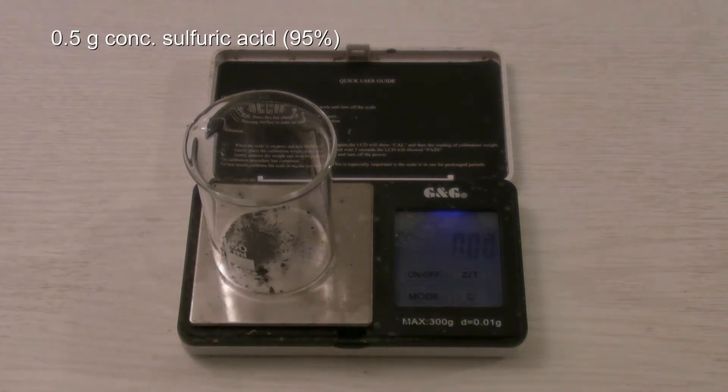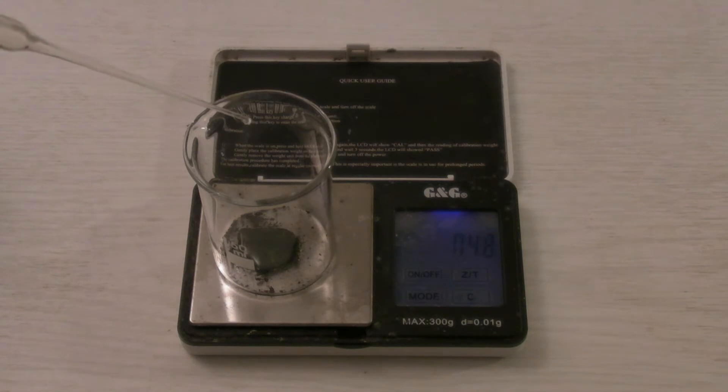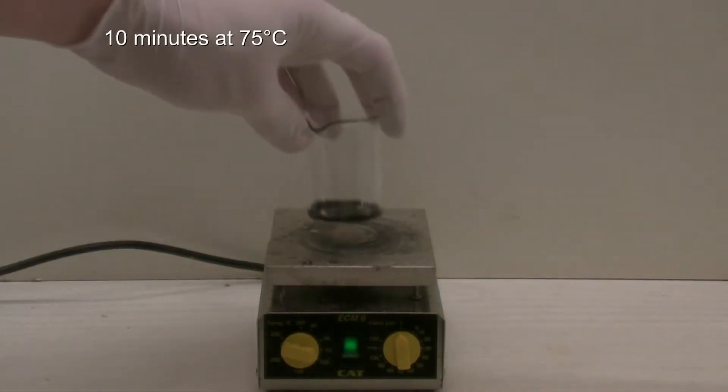Then, 0.5 grams of sulfuric acid were added. Even at room temperature, the indigo reacts slowly with the acid. To speed up the reaction, the beaker is then placed on a hot plate and heated up to 75 degrees C for about 10 minutes. It should be taken care that the indigo is mixed completely with the acid.